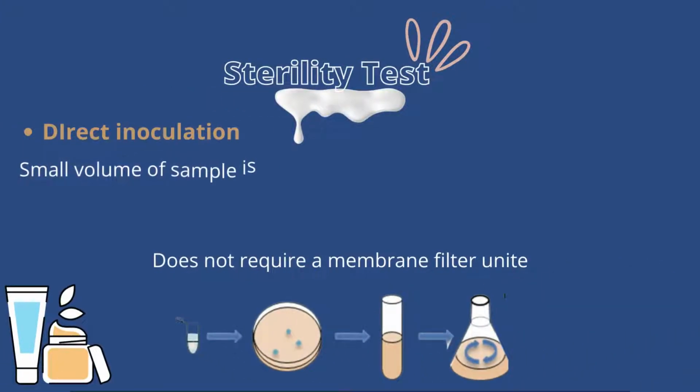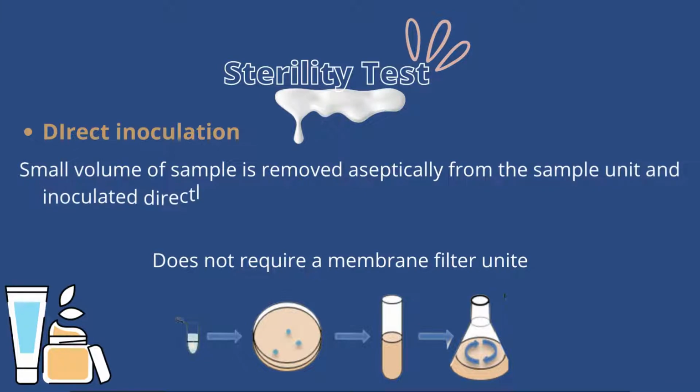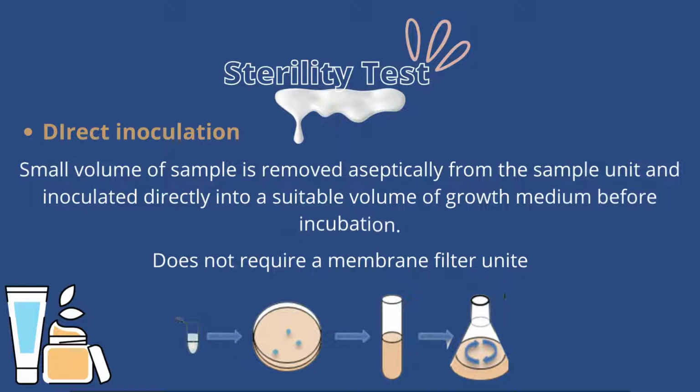Direct inoculation. A small volume of a sample is removed from the sample unit and inoculated directly into a suitable volume of the growth medium before incubation, and this does not require a membrane filter unit.